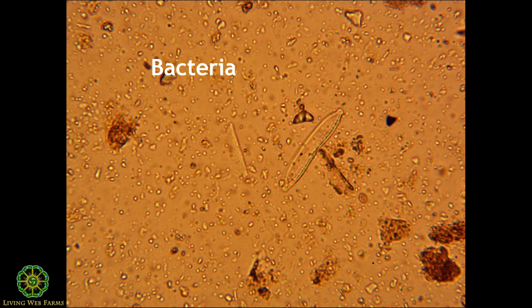This is a picture containing many things, but most of what you see is a lot of bacteria. You can see the little round dots, the rods, slightly larger rods, slightly smaller rods. Lots of different shapes of bacteria. I have a chart from Elaine coming up that will show you the different sizes. This is a pretty low dilution, probably a 1 to 5 dilution, and we'll talk about that when we make our first sample. It looks very, very heavy in bacteria.